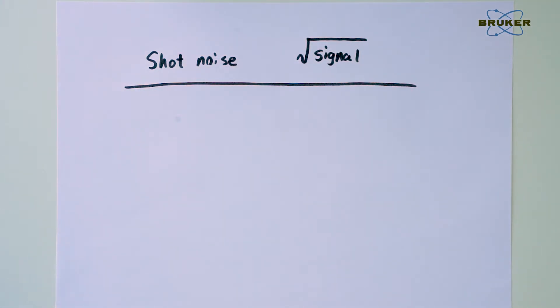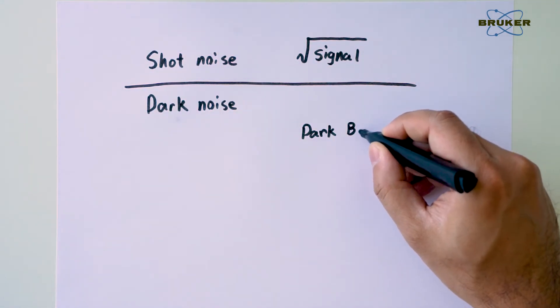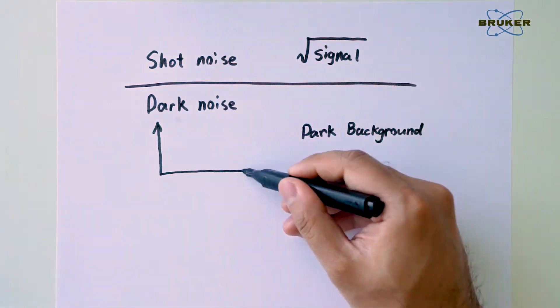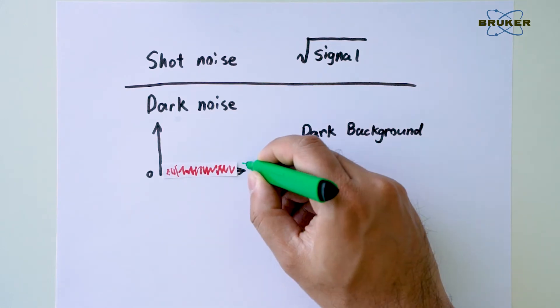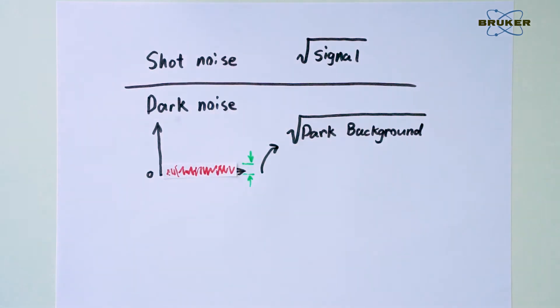When there is no light, the signal level of CCD is still not zero. This is called dark background. It follows the same rule and leads to a noise of square root of the background level. Although we can correct the offset, the dark noise will stay in the measurement.